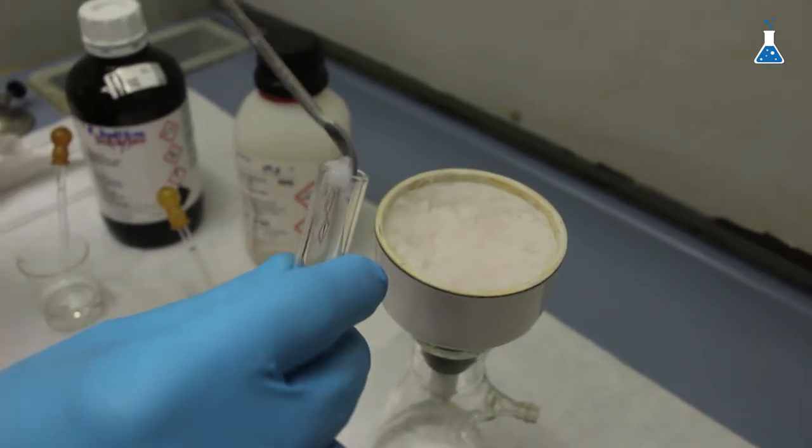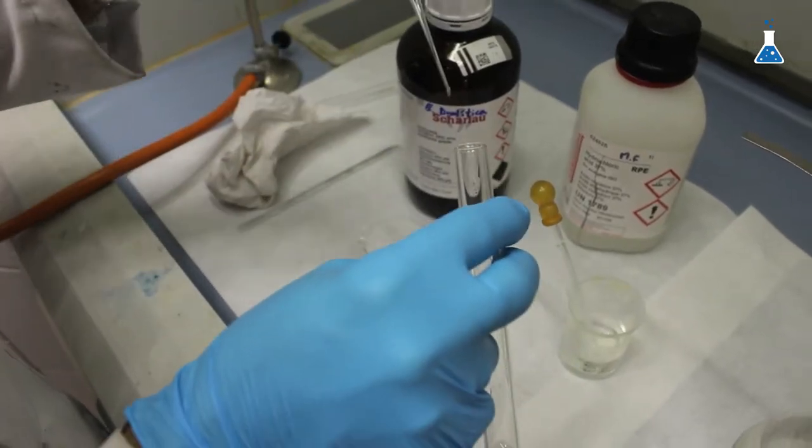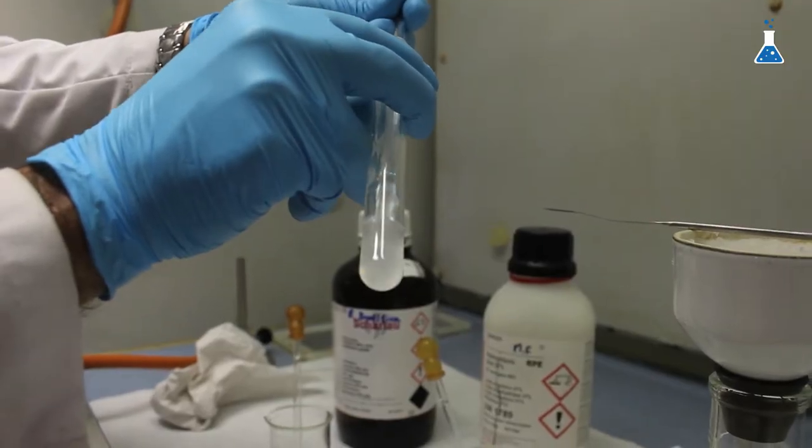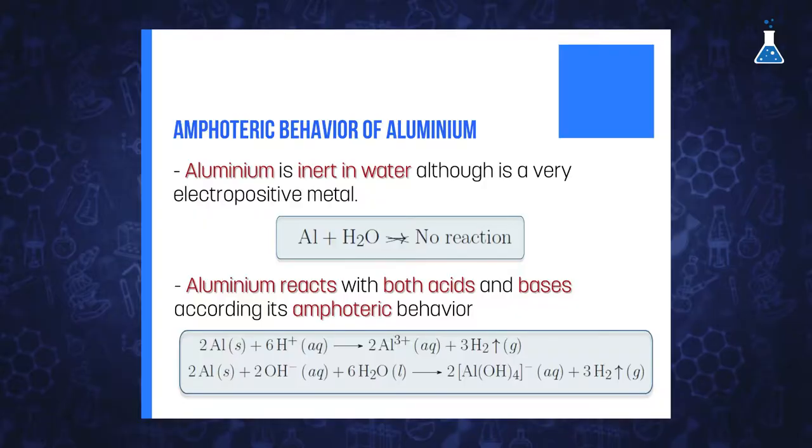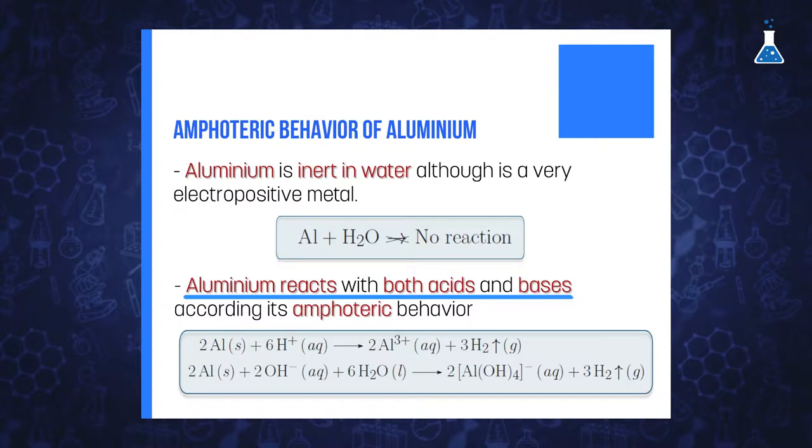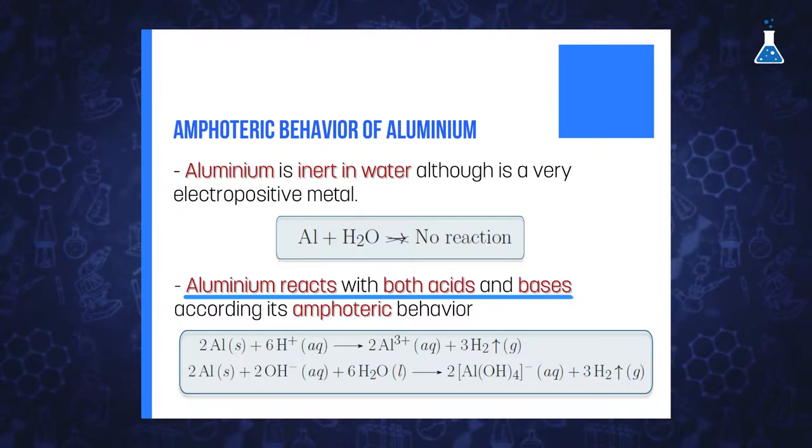Let's now check what happened in the second test tube with a diluted solution of sodium hydroxide. Again, the solid dissolves showing the acidic behavior of the solid for this reaction. So, aluminum oxide reacts with both acid and bases, which indicates an amphoteric behavior of this compound.